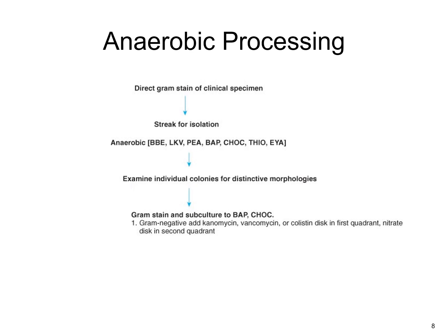And so that would help give a preliminary report. You still wouldn't know whether or not it was aerobic or anaerobic at this point, but if you did see spores, that could kind of lead you in one direction or the other as well, and it can help correlate with what you could potentially be seeing in that specimen.